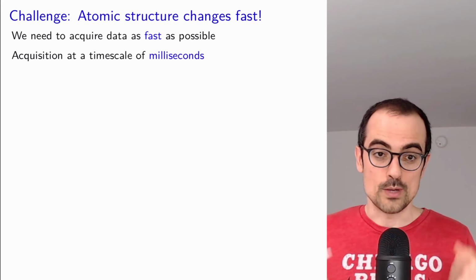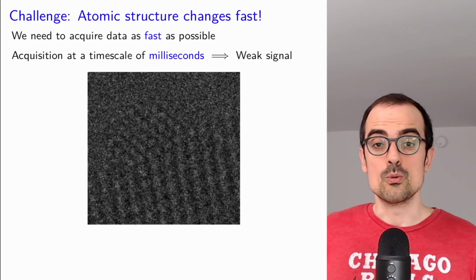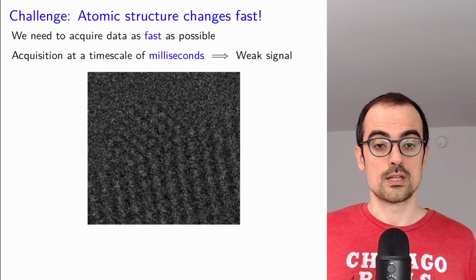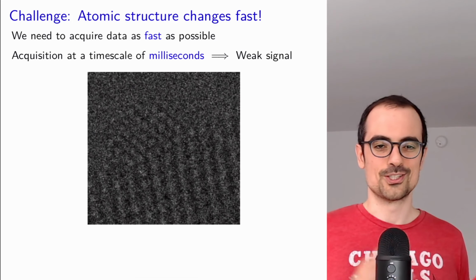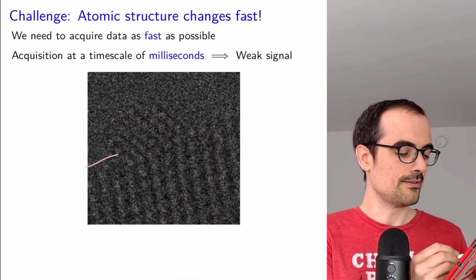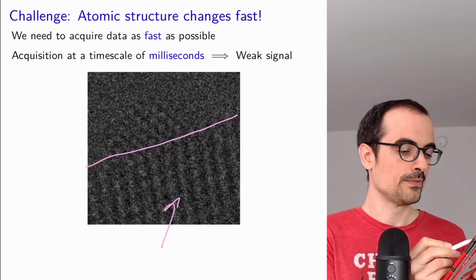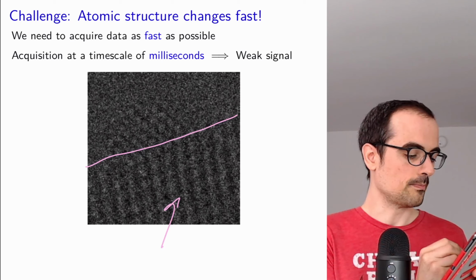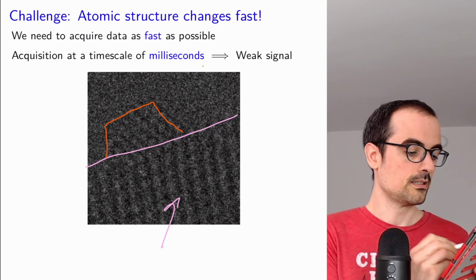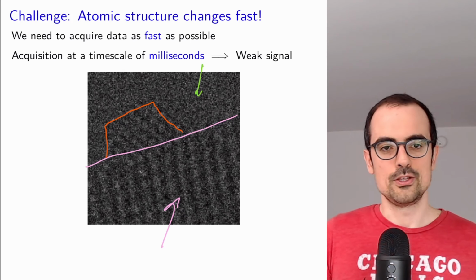The problem is that when we acquire data so quickly, the signal is very weak because there are very few electrons hitting the sensors, so that we can barely see what is going on. Here I promise you, and you will see later that this is true, that there is a supporting material, which is cerium oxide, and on top of it, there's a platinum nanoparticle that is sitting there, and then there's vacuum. But just by looking at it, you could hardly tell.